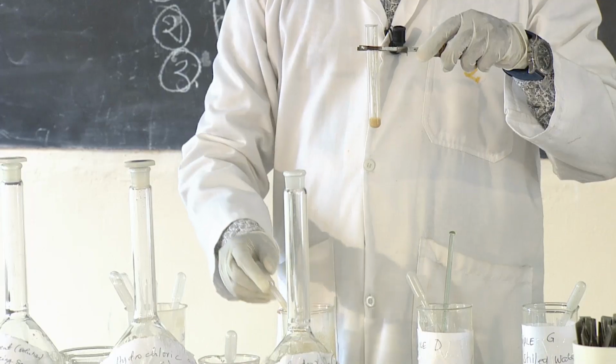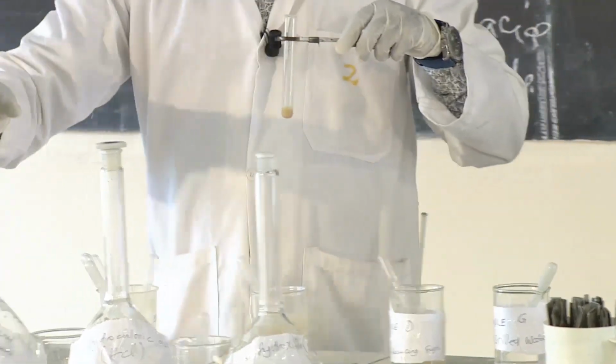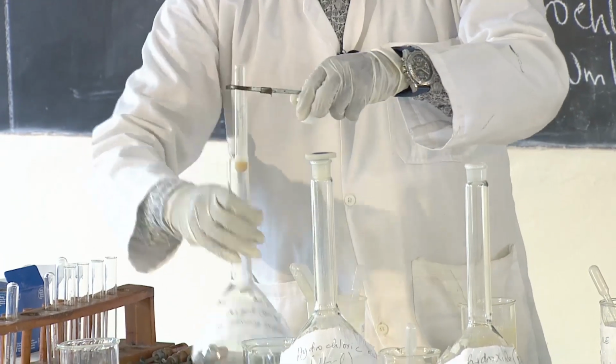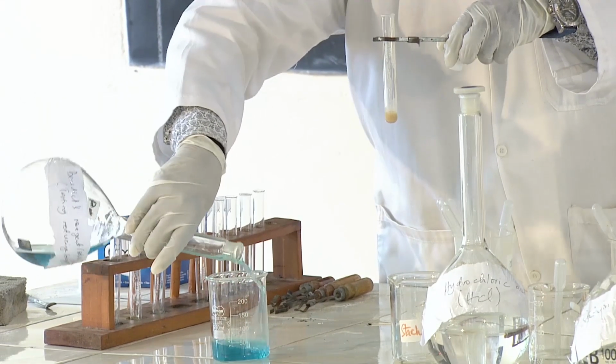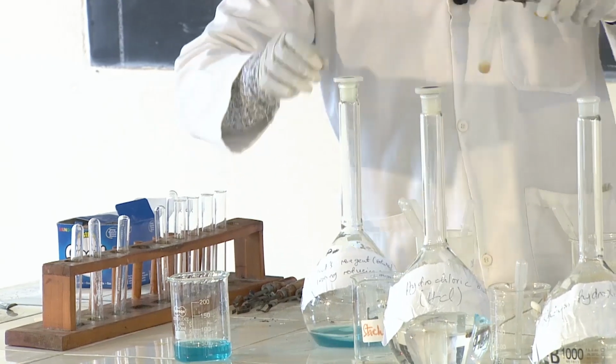Then from there, you add the Benedict's solution. This is the Benedict's solution. After adding the Benedict's solution now, you get a dropper.